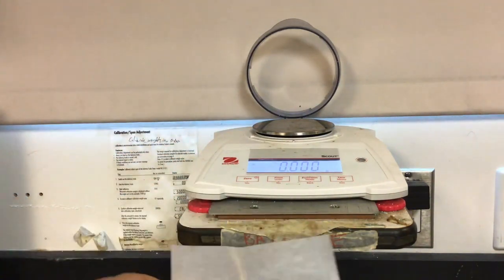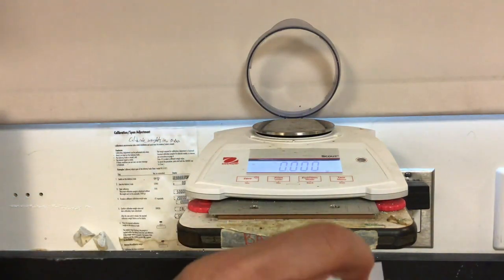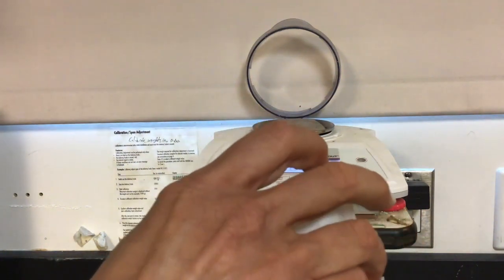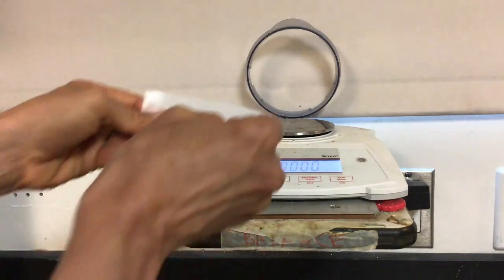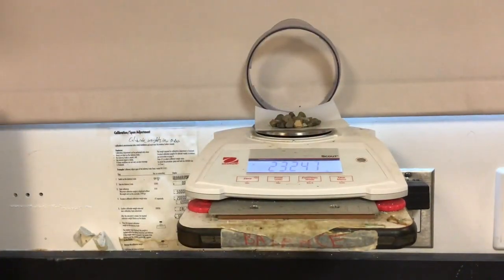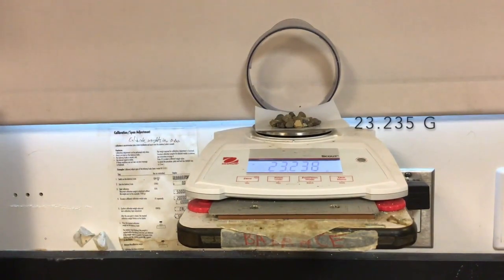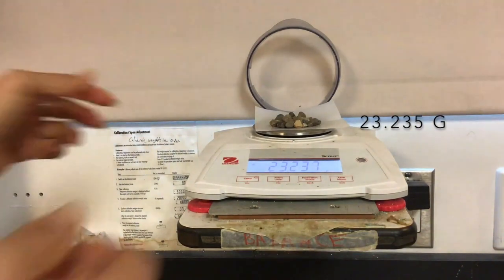When I pour some rocks in here, we want between 20 and 25 grams. I'm going to add some rocks to my paper and then get the mass of the paper plus the rocks. That's about 23.235 grams.